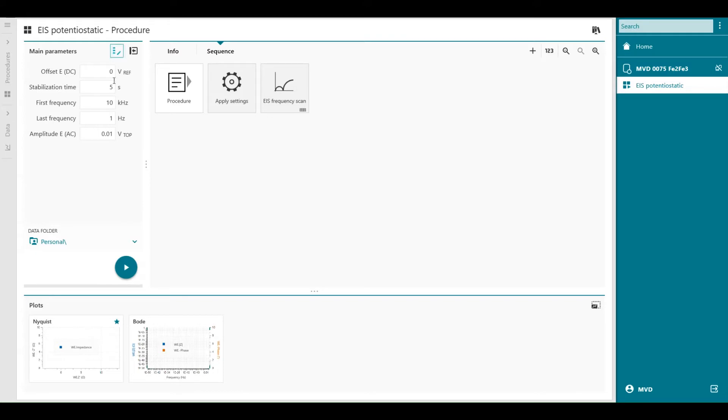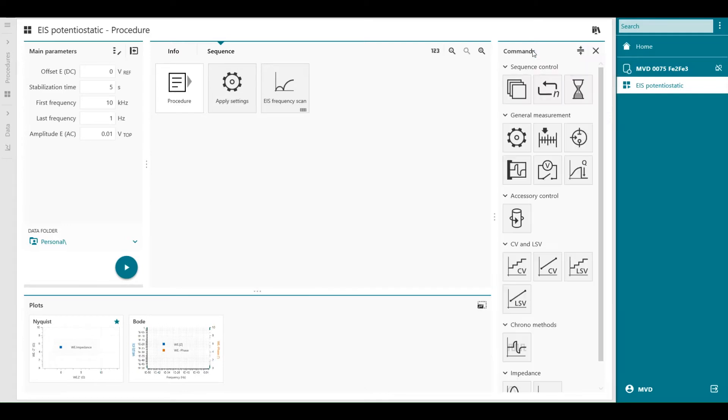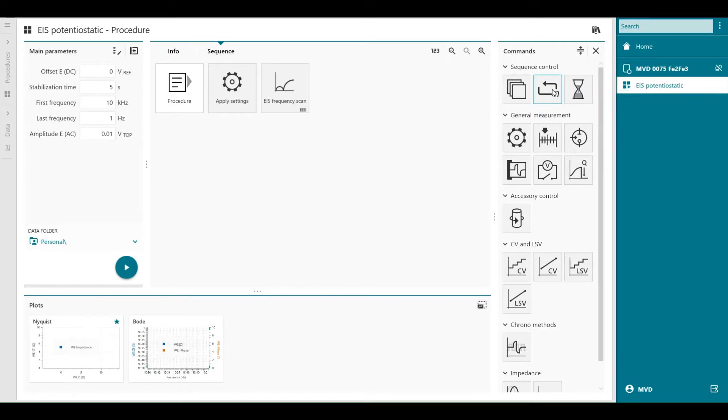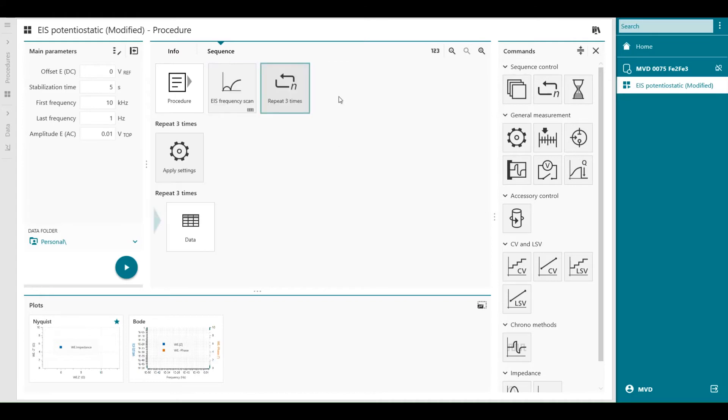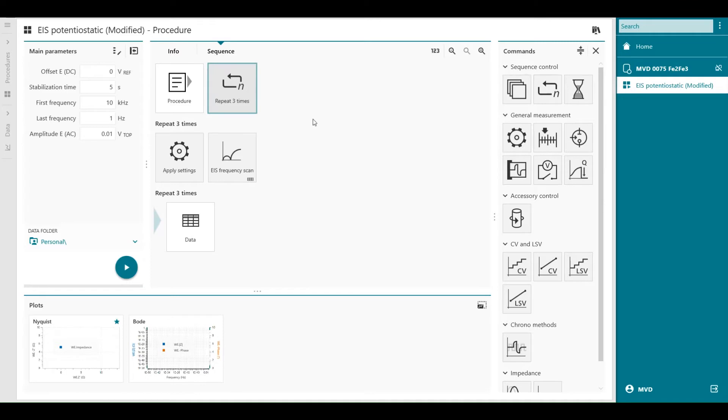At the moment there is no repeat loop in this default procedure so we can add from the command list this command repeat multiple times or for multiple values. We drag and drop this in the procedure in sequence. Then we can drag the apply settings underneath the repeat loop and the same we can do for the EIS frequency scan.